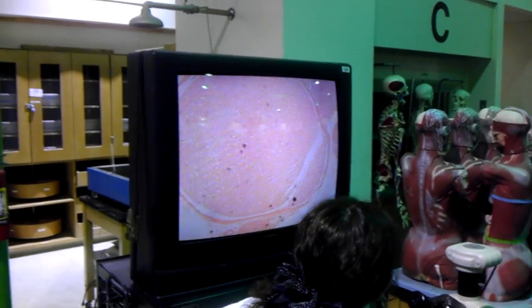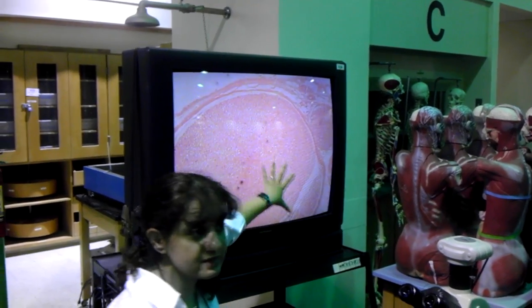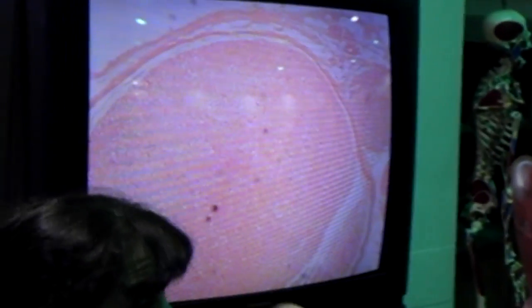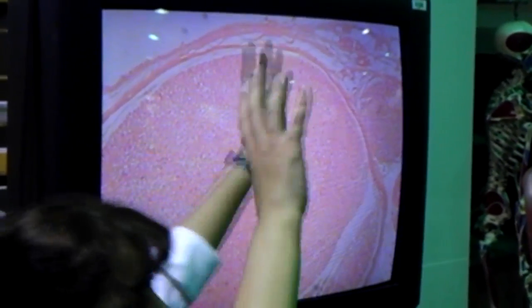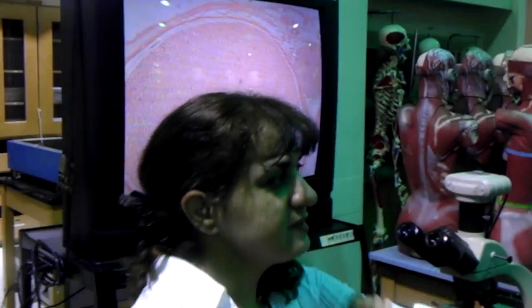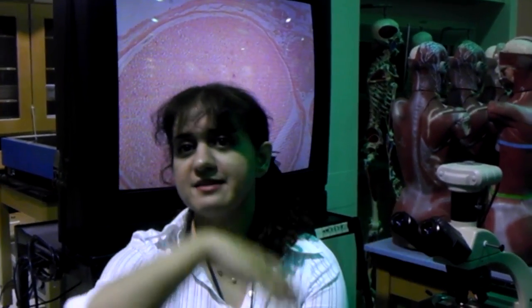Inside this structure, you can see the fascicles of what? Fascicles of axons, right? Because the nerve consists of bundles of axons. All of these axons together make a bundle that we call a nerve. So this is the cross section of the nerve. If you remember the story of the muscle fiber and the skeletal muscle, in the muscle tissue we said that around the entire skeletal muscle we have a connective tissue membrane which is called what?